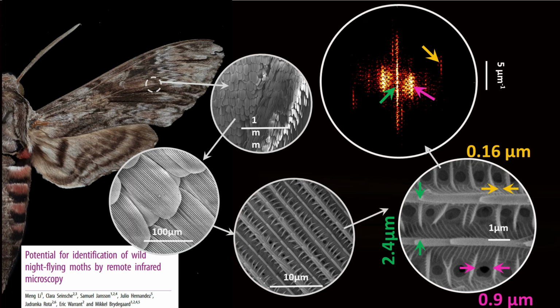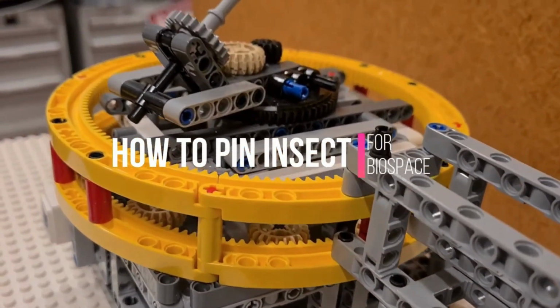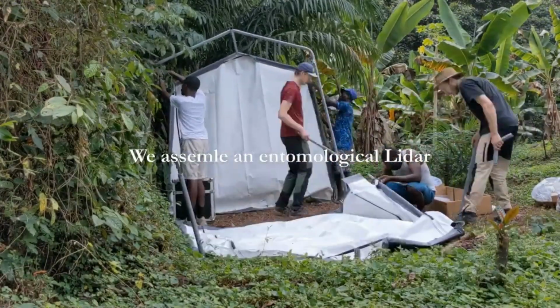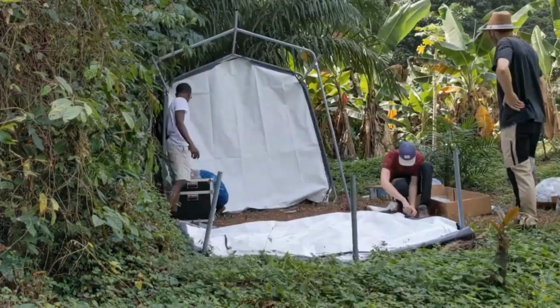Outside of identifying glassy-winged insects like hoverflies and mosquitoes based on the wing interference signals, it is also possible to identify diffuse wings like scaled wings from moths and butterflies based on the wing surface roughness. Such a thing can also be accomplished with biospace, but again, you need to upgrade the wavelengths and the camera to the suitable range. If you're interested, you can look up this study to see how we conducted it and separated moth species based on the wing roughness. Our group also has a YouTube channel where we upload and document most of our recent workshops and field work, and we have some tutorials, for example, how to pin insects for biospace. If it's needed, you can check it out.